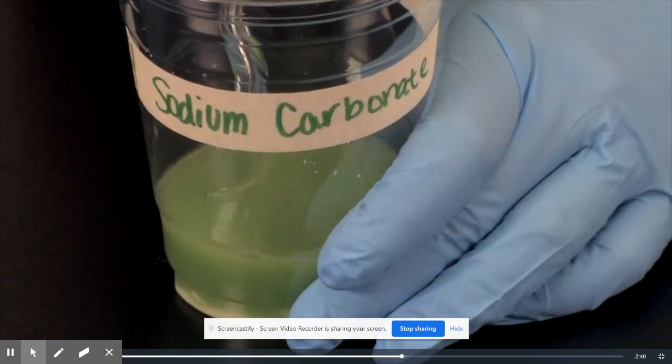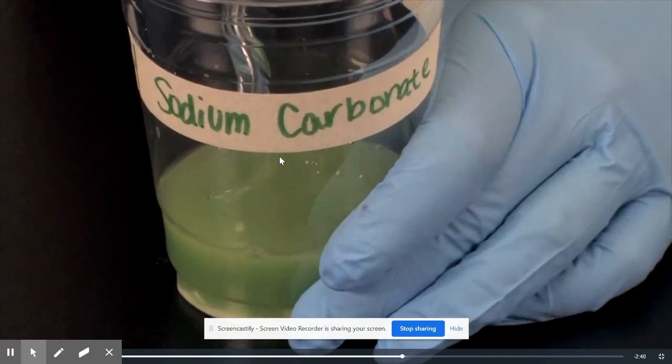I know for sure that in 6H this did happen for you, that it did turn olive green, but I think for 6J and 6L, it didn't. I'm not sure why, but it should have turned olive green like this color here. So there was a color change. The temperature should have increased, though I'm not sure if you were able to feel it. There was no gas, no precipitate, and so there was evidence of a chemical change.